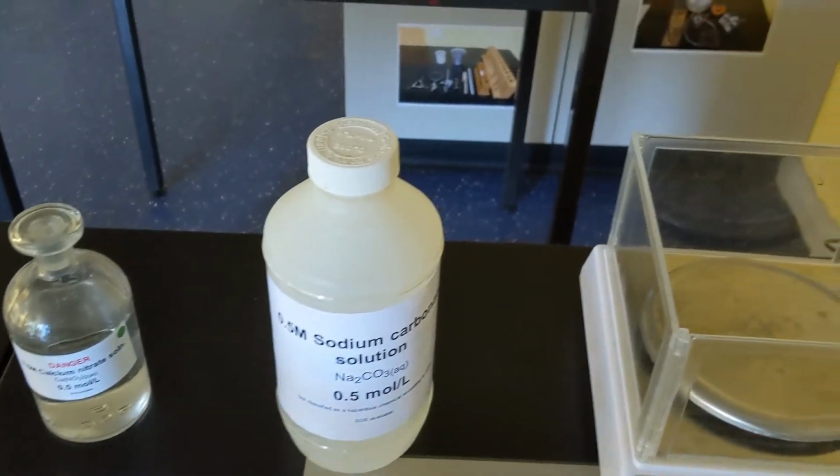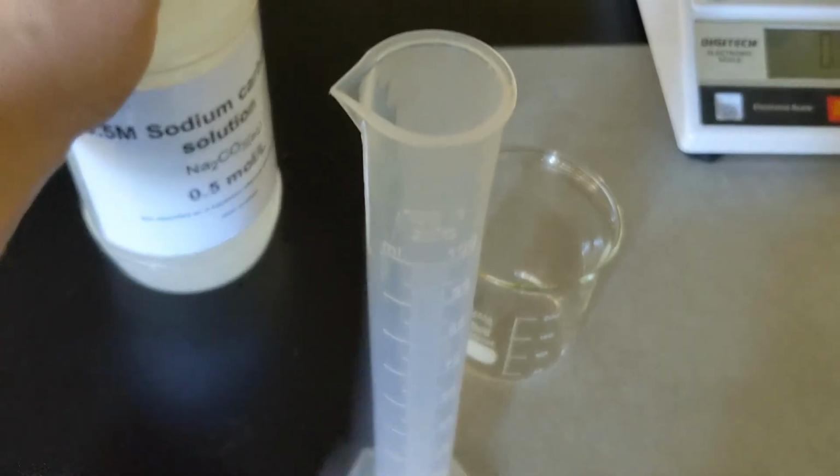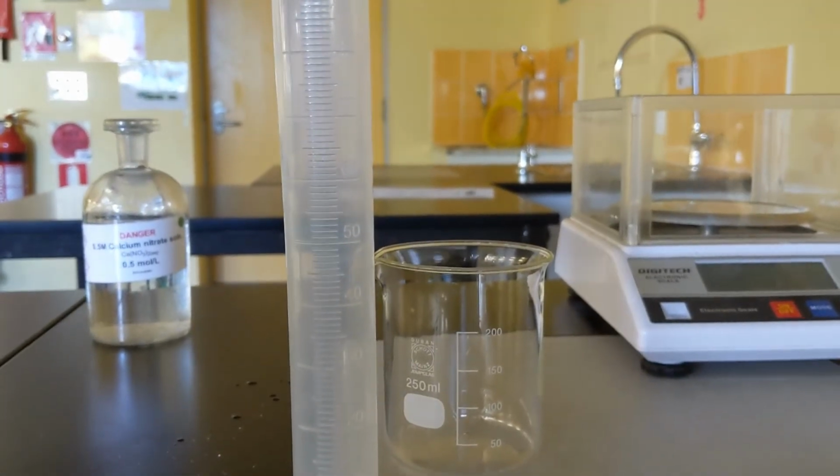Now we're going to grab our sodium carbonate and get that ready to pour. So we want 50 mL of this one as well. With one hand, I'm going to try and get this cap off. It had a bit of a safety lock on it. One-handed is a little bit difficult. Then I'm going to pour my 50 mL into my measuring cylinder.